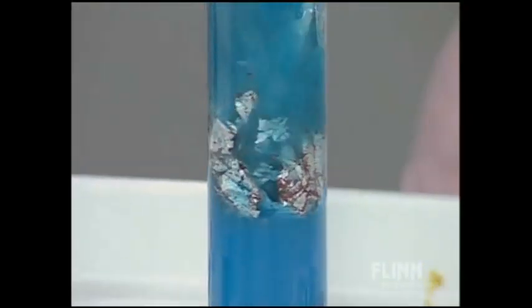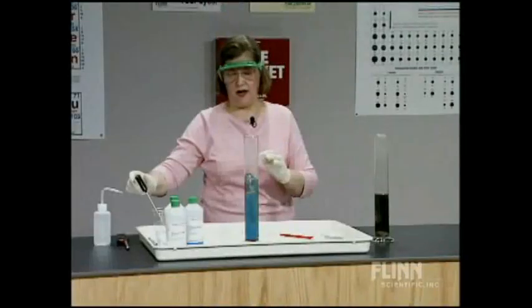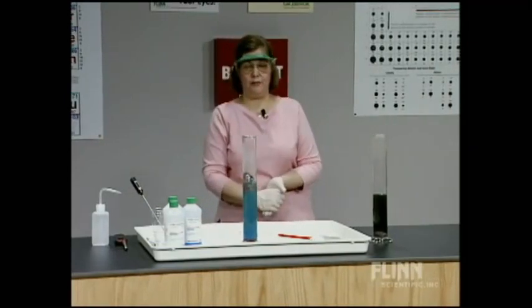So the chloride ions appear to be necessary for the reaction to occur, even though if we write the net ionic equation, it's not involved. And this is getting pretty hot. We're up to about 40 degrees, 45 degrees or so right now. You can see that now we're starting to really go to town here. And I think that's probably just because of the inefficient mixing in that relatively tall hydrometer cylinder.